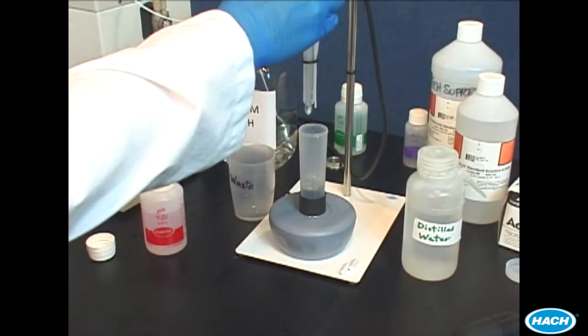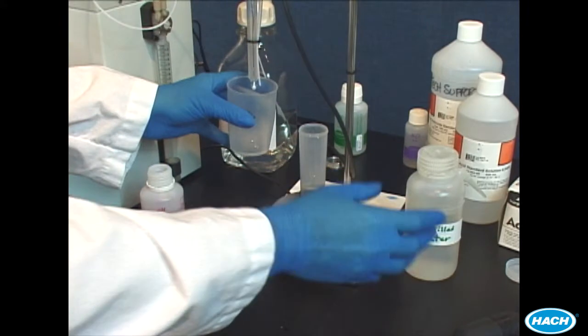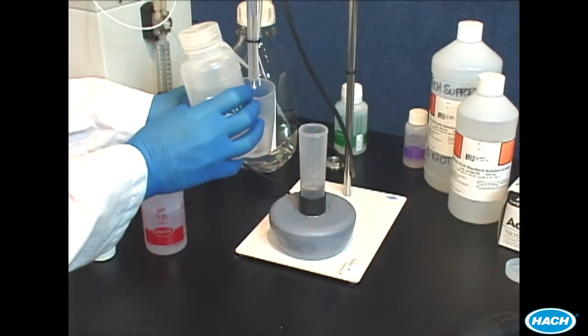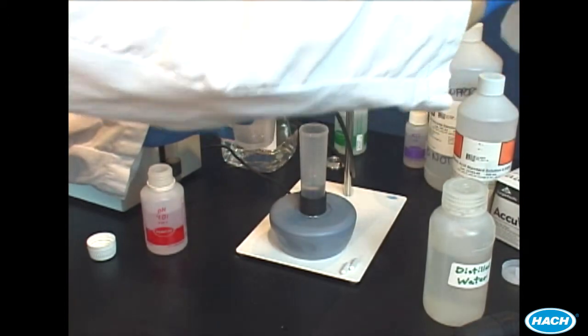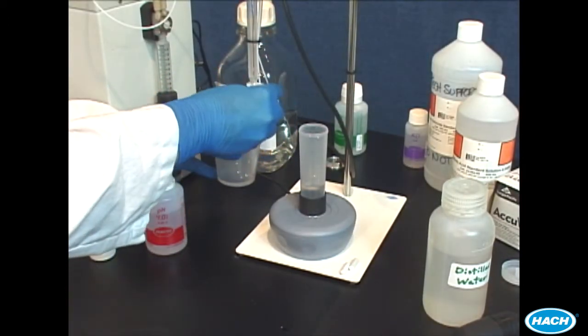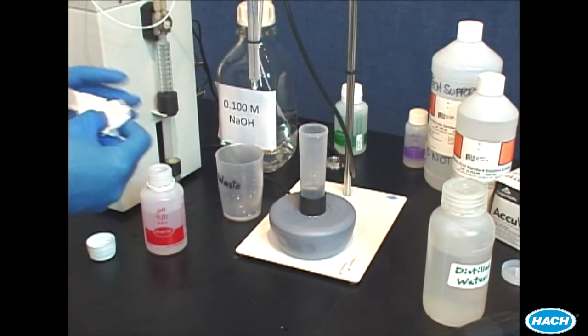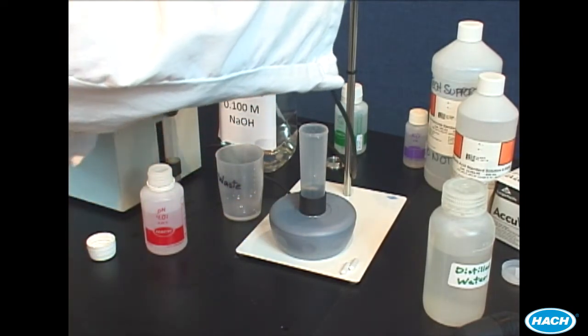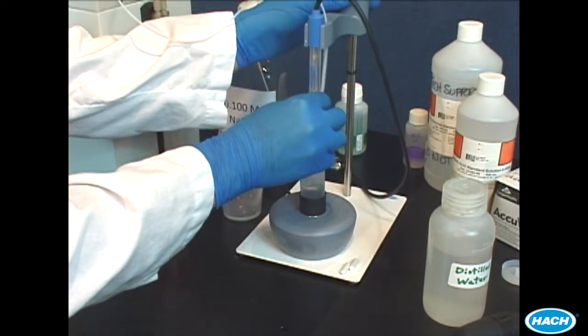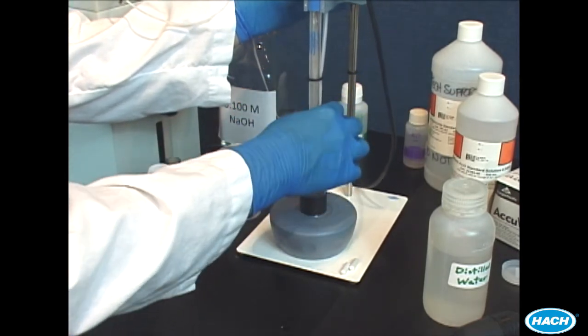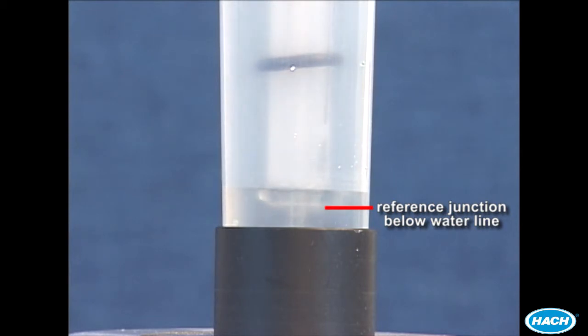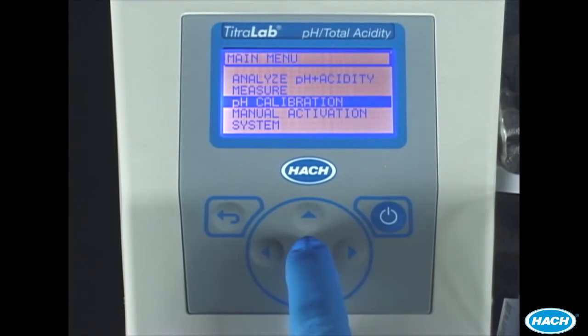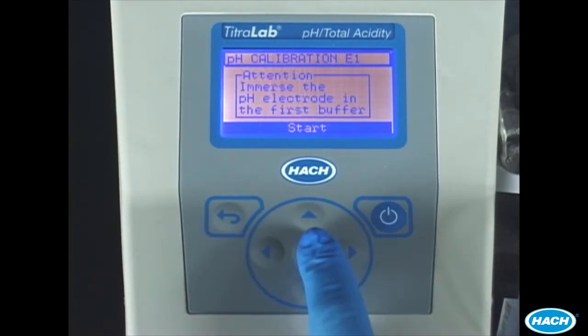Rinse the pH electrode over a waste beaker. Lower the electrode into the buffer. Be sure the electrode bulb is completely immersed in the buffer. Select pH calibration and then press the check mark to start the calibration.